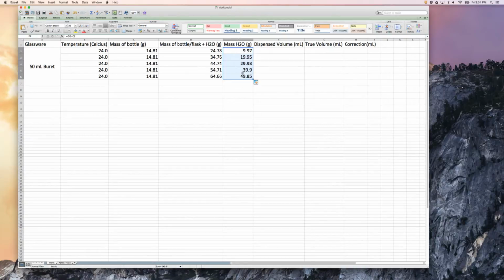All right? Okay. The dispensed volume can be calculated one of two ways. You can do it by hand and subtract the initial volume reading from the burette from the final volume reading, or you can calculate the dispensed volume yourself, not have to put it in the Excel, and then just input that here. So to input that here, we're looking at approximately, let's say, 10.010. And for us to get the proper number of significant figures for our instrument, we need 2 decimal places.